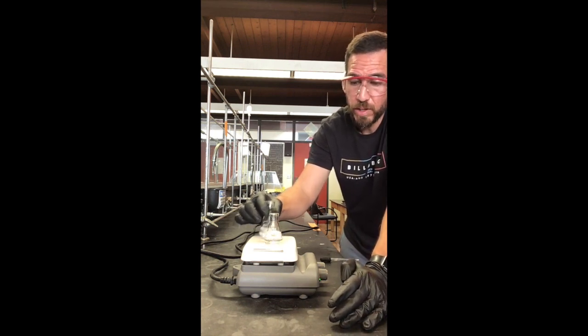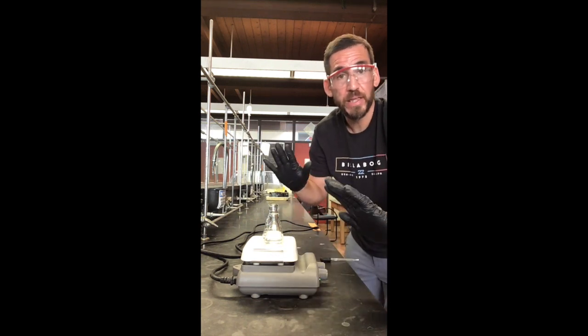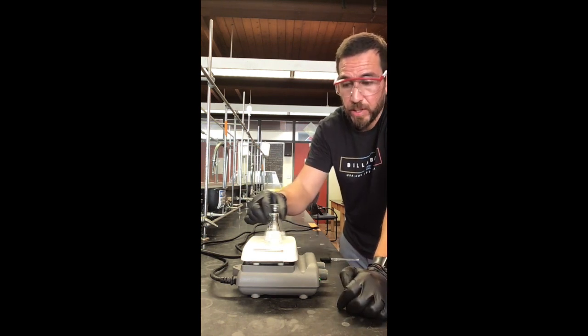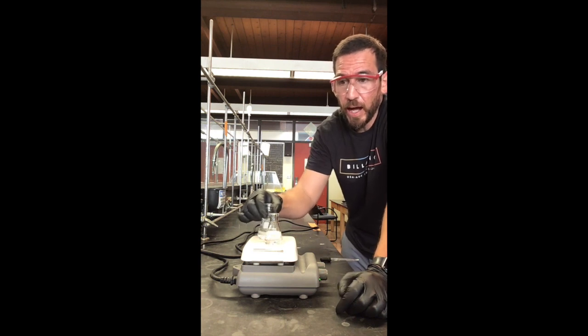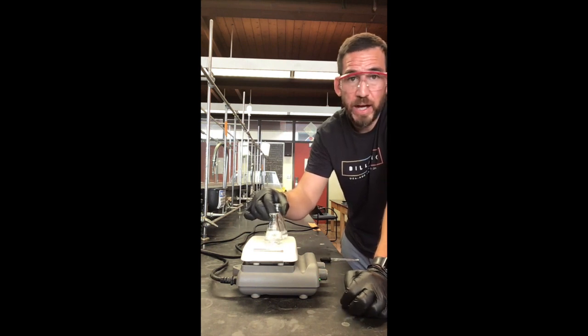And once it's all dissolved, then what we're going to do is take that off the hot plate, place it on our workbench, and then let it sit there for just a few minutes. Depending on the substance, it could take 10 to 15 minutes to crystallize completely, or I do personally know that caffeine will crystallize very quickly in ethanol, and so it won't take much time at all.